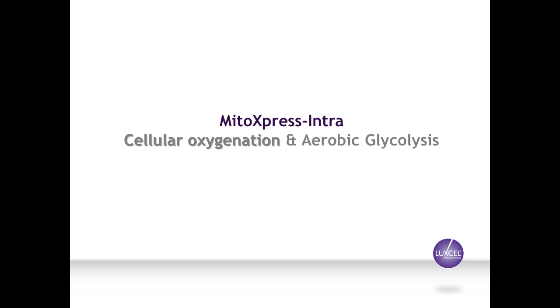So moving from that to the assessment of cellular oxygen consumption and aerobic glycolysis, we've spoken about using 3D maybe to increase the biological relevance of in vitro cell models. People use that. We've just taken a look at what is the relevant glucose concentration, and maybe beyond that, what's the relevant substrate? Should we be using glutamine? Should we be using fatty acids? But an often overlooked parameter when assessing the biological relevance of an in vitro model is the oxygen concentration that should be used for the analysis. So very briefly, as an example, let's look at, first of all, how oxygenation can be measured conveniently on a plate reader, and secondly, how it's related to this concept of aerobic glycolysis or the Warburg effect.